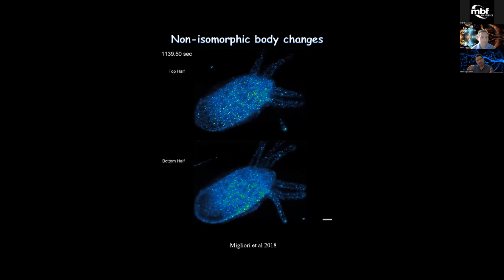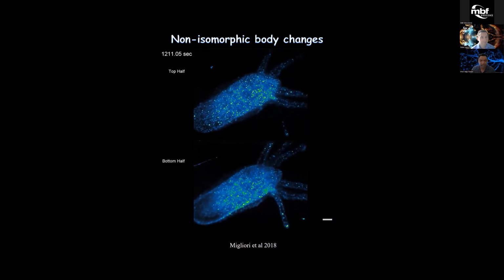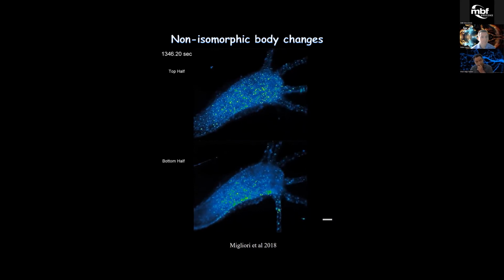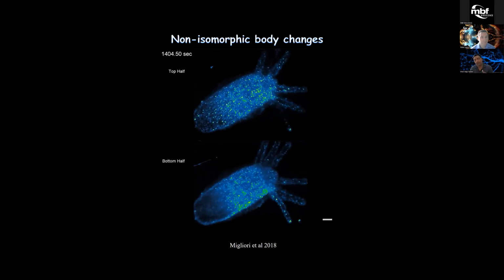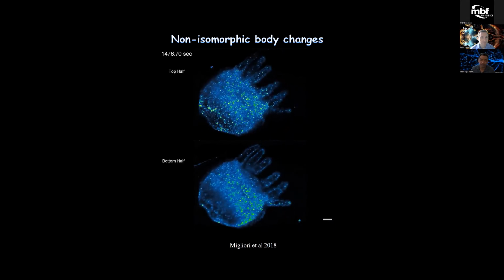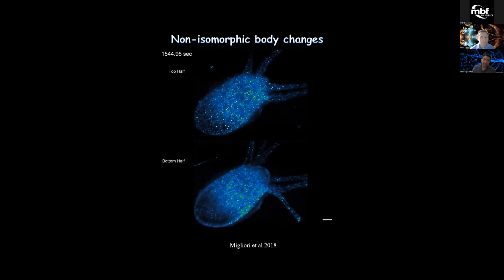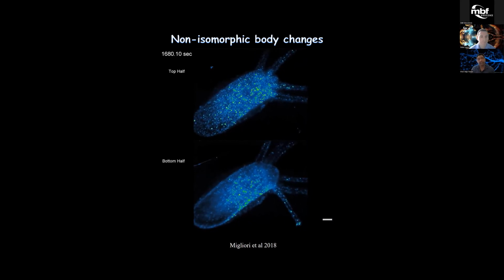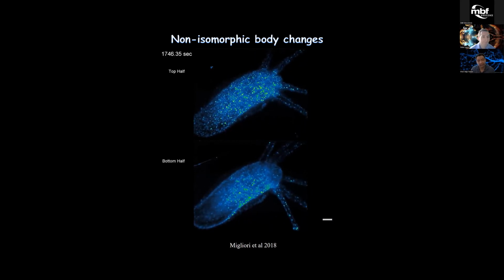So these kinds of samples present challenges for standard light sheet configuration because it's changing shape. And if you are using orthogonal illumination and detection, depending on the shape, the compression of the animal, your light sheet may bend different amounts. So you really need to make a lot of effort on adaptive correction or hardware-based correction in a standard light sheet geometry.